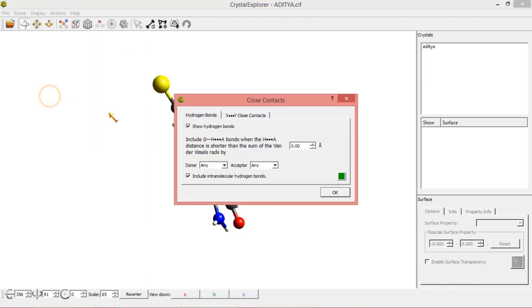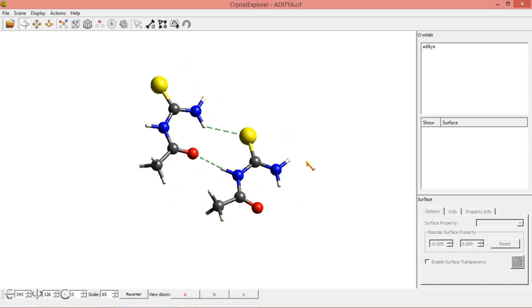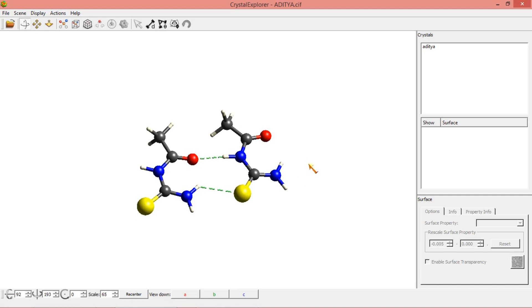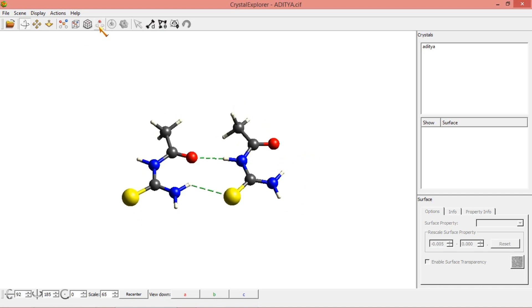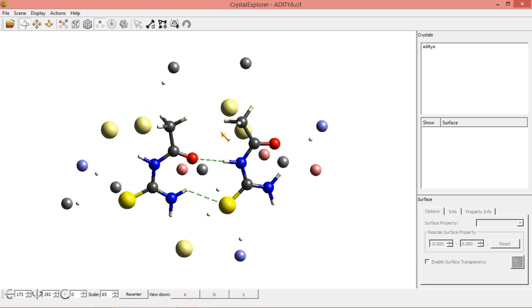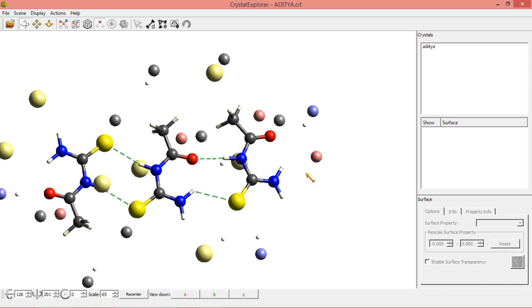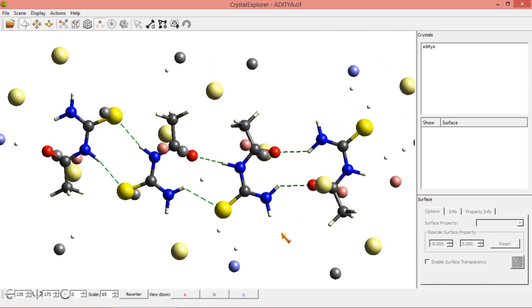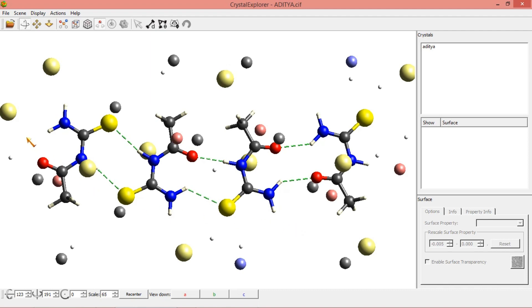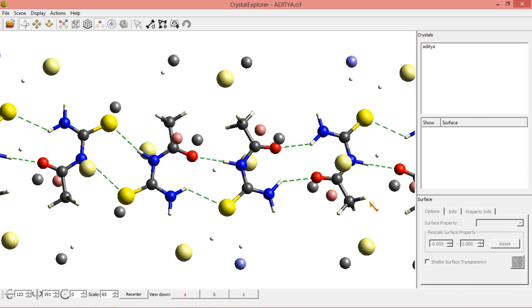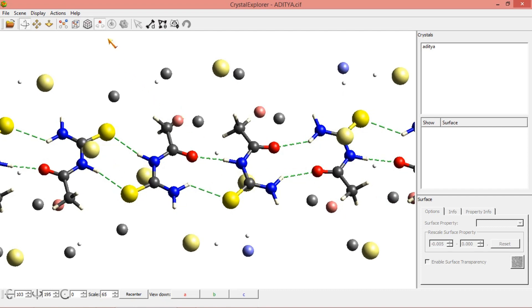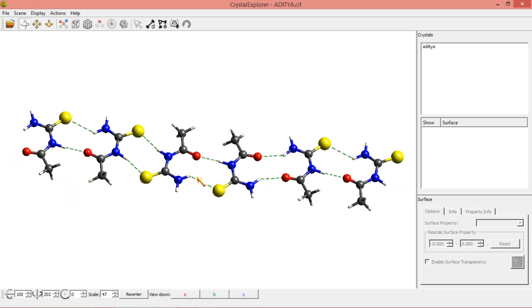Go to Hydrogen Bonds again. I am deselecting and selecting this. Now just select this — you can see some fragments over here. Click on this fragment, and on this side, this fragment. You can form this structure. If you want to increase this chain, just click on to this side. This is the way you can increase the contacts using Crystal Explorer.